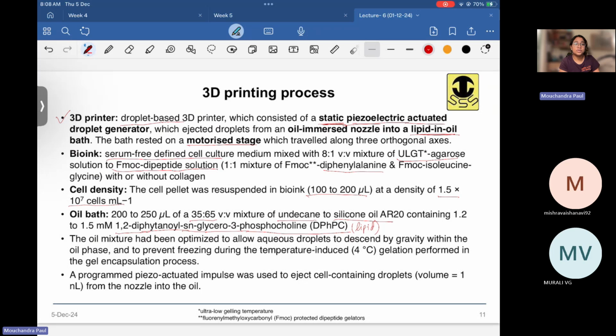But still, even if you eject the droplets in air and you solve the problem of splashing and spreading, you cannot make sure that the droplets are fully spherical. The droplets will become like this on a surface. It will become like this, right? When you position it in air on a stage. So the resolution of the 3D structure that you can make basically lowers.